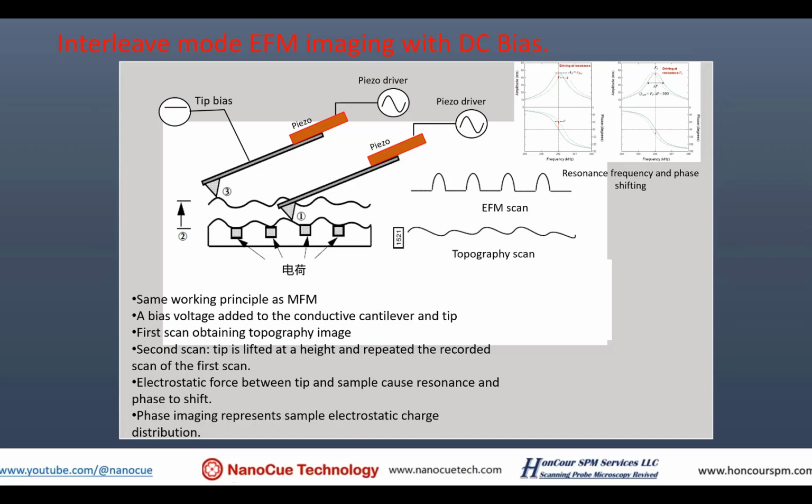That's because of noise, because the tip has an oscillation, and if a charge is very small, the oscillation caused by the charge is very small, and then you have very low signal to noise level. It's very, very hard to detect a very small signal in a big noise. In this case, even if you have the cantilever in the air, with nothing disturbing it, there is a certain amount of Brownian motion of the cantilever that causes the tip to oscillate with noise.